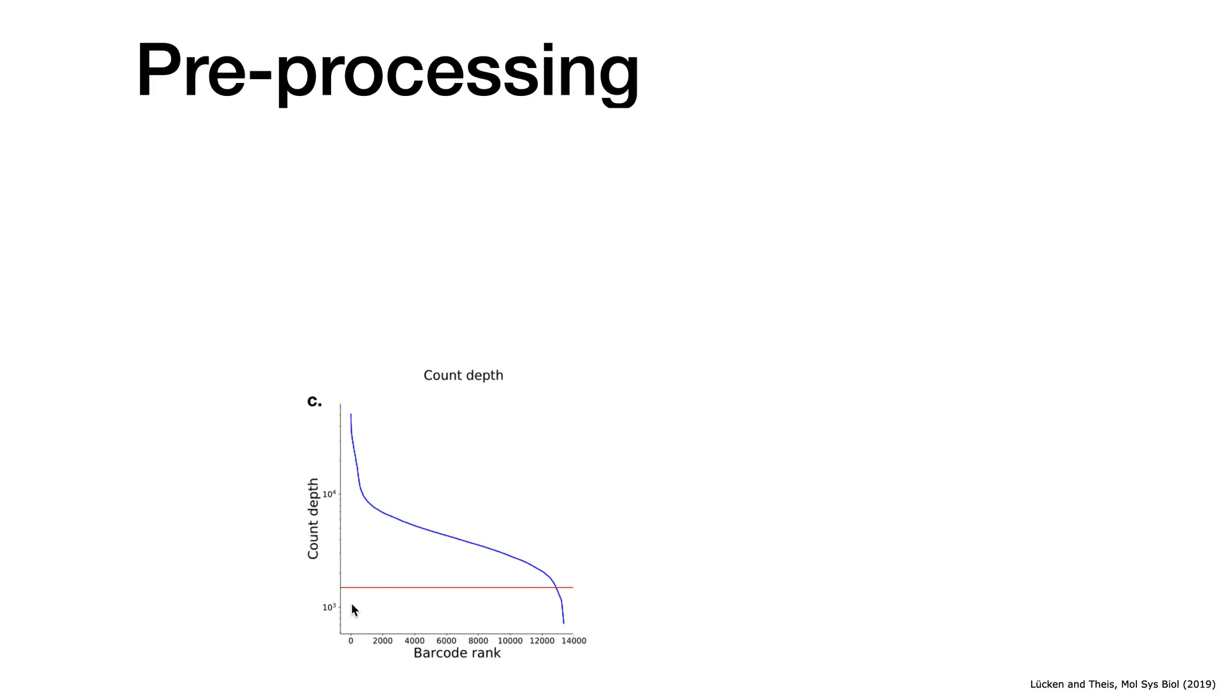However, you also have a lot of barcodes that have few molecules assigned to it, and the reason is really simple. In a 10x experiment you have a lot of empty droplets where you don't shoot cells into, if you remember the small video I showed this morning.